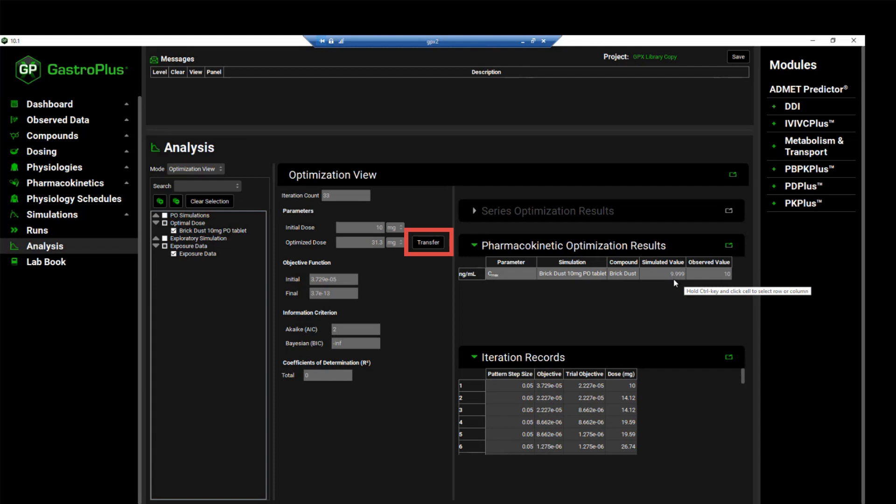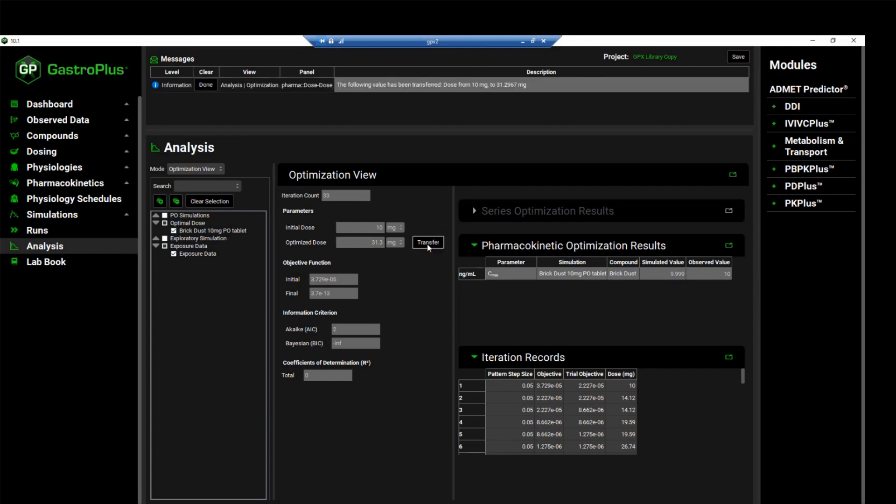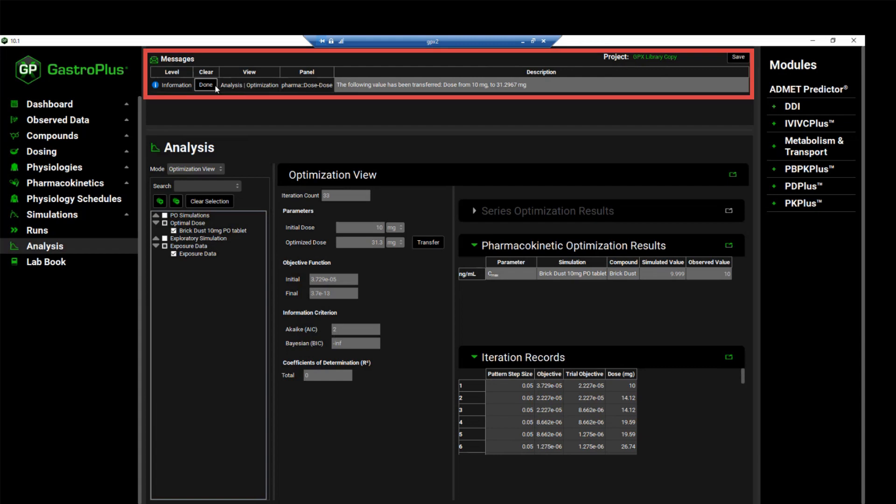We will click transfer to update the administered dose. Note that a message has appeared in the messages center that confirms that the update has been made and highlights in which panel the change has been made. We will click on done to clear the message.